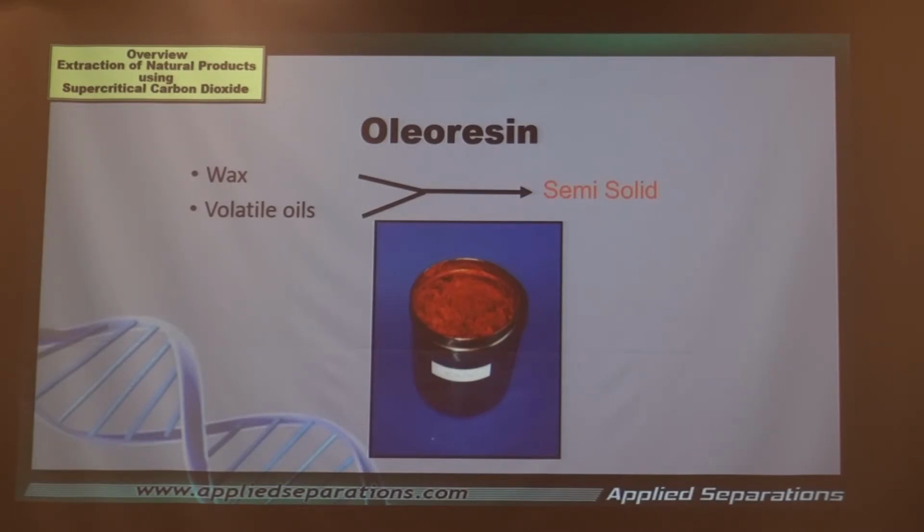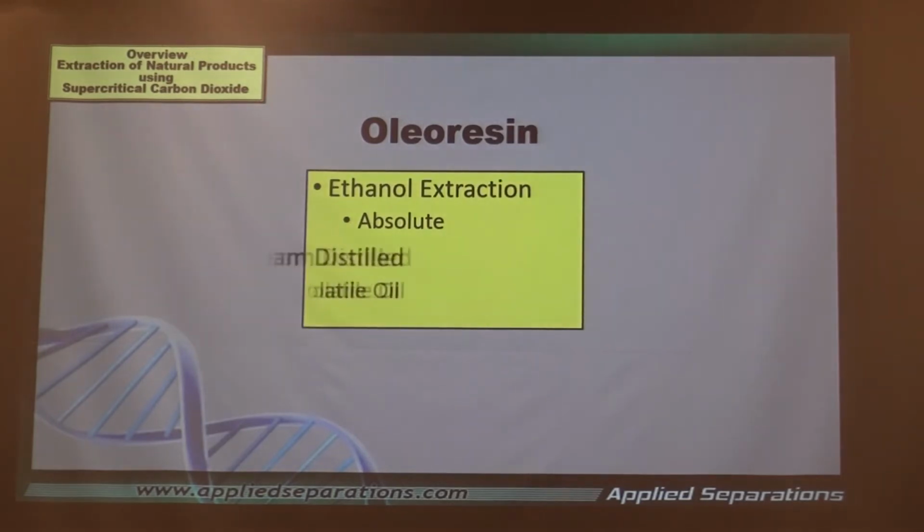We Americans bastardize the name, so we just say concrete because that's the English that we have. This is a paste. Now we can do the separation of the essential oils this way, or we can take it immediately from the raw material. Either way, this is what we have to do.